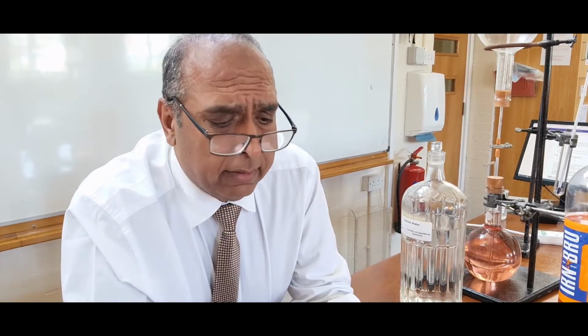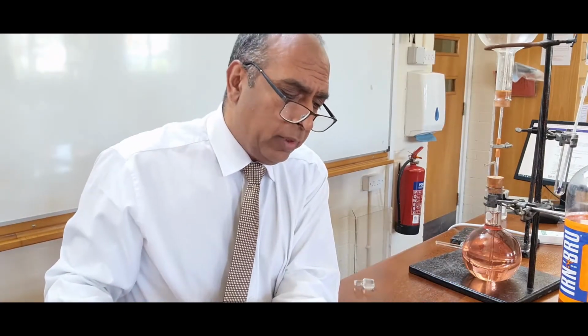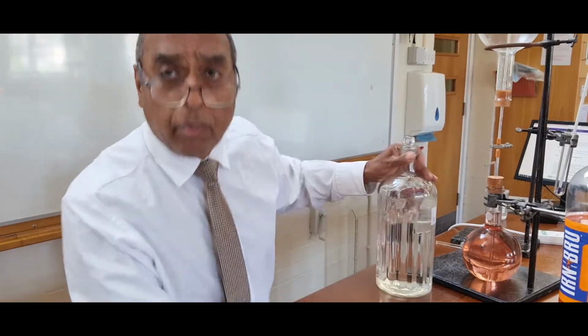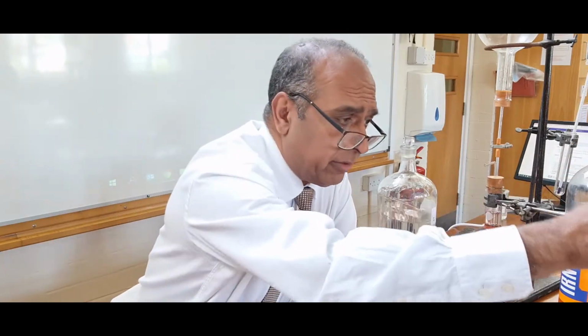Solubility. I'm going to try and introduce to you some ideas to do with solubility. Let's start with some water as a solvent. Here I've got distilled water. Now, distilled water is about the purest kind of water we have in chemistry laboratories. We boil tap water, it turns into steam, we cool the steam down. That's distilled water, carried out by simple distillation.